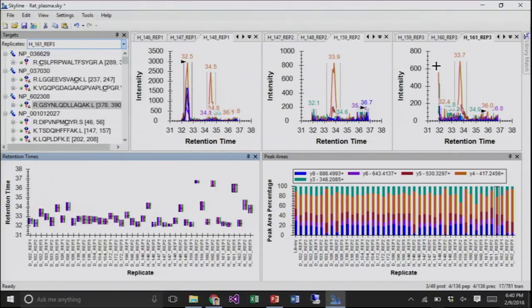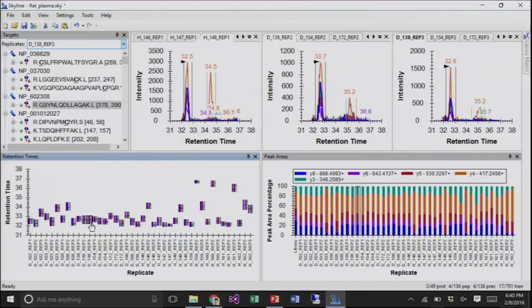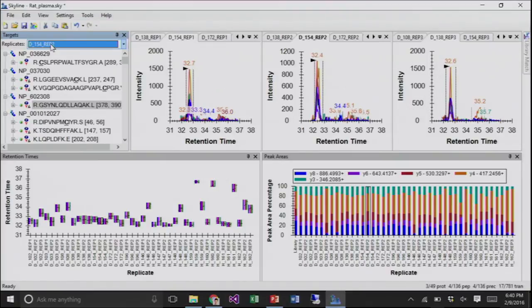So let's take a look at one where we're actually doing okay, just to get a sense of what the landscape looks like. So what can people see in the landscape? Actually, I'm just going to click up here and go down through it again.